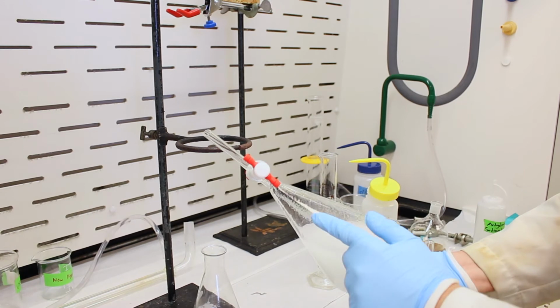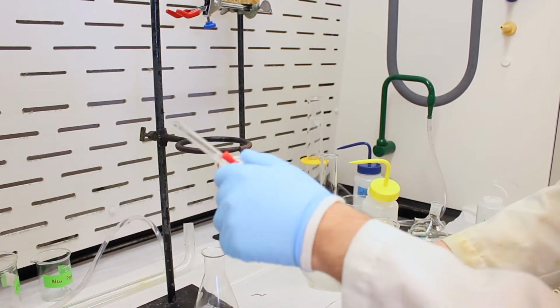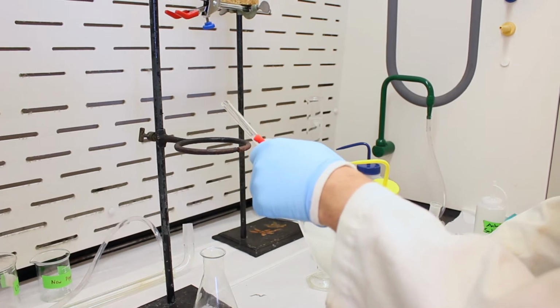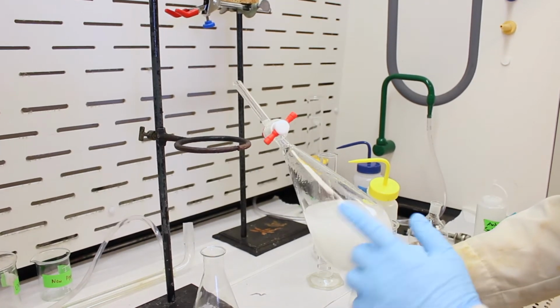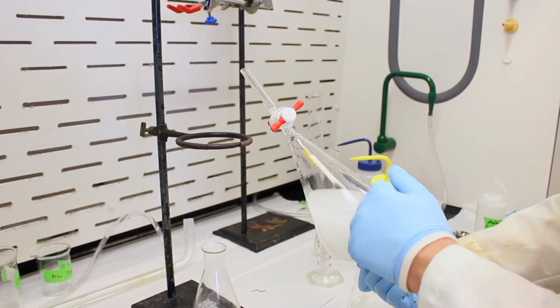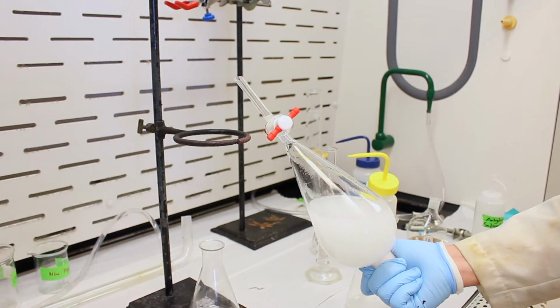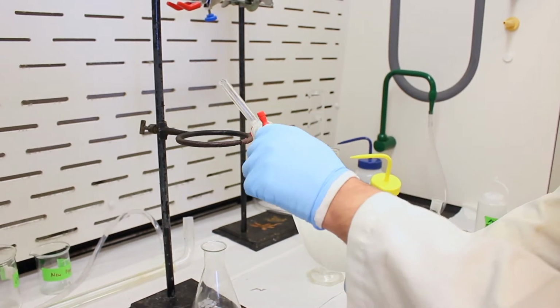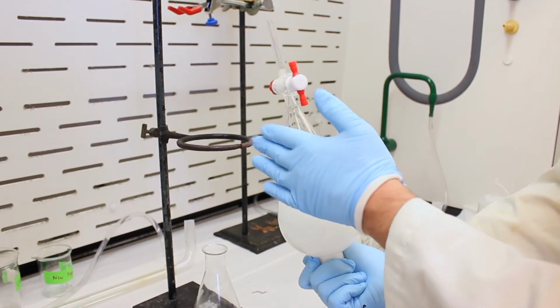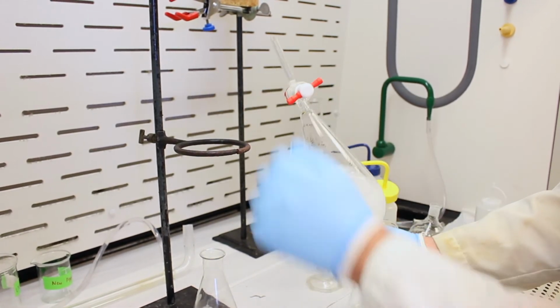Now when you vent, it's important to point it into the hood. If you were in the lab, you wouldn't want to point it at your buddy. So always point it into the hood. The magic rule in separation is kind of like the rule of 3. You shake 3 times and you vent 3 times, and then we're going to extract 3 times. So 3 is kind of a magic number. There's a little bit in the stem, so I'll open it up here to try to get it to come back in. It might not separate.